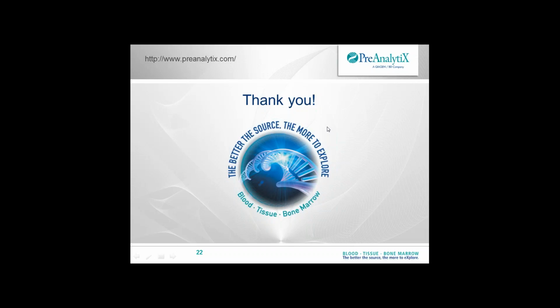Okay, thank you. The next question that I have on the table, which a couple of people were interested in, is can they use the frozen plasma with the QIAsymphony circulating nucleic acid kit for isolation? Yeah. This is a very good question, and the answer is yes. So you can of course separate the plasma and freeze it, and after thawing it can be used in nucleic acid isolation kits, of course.